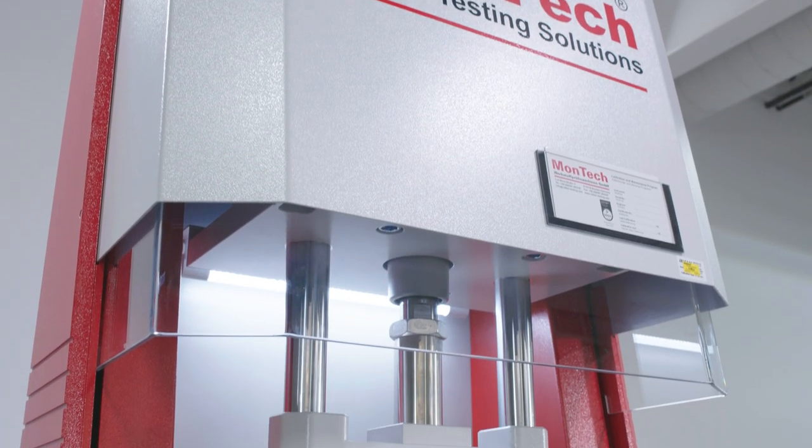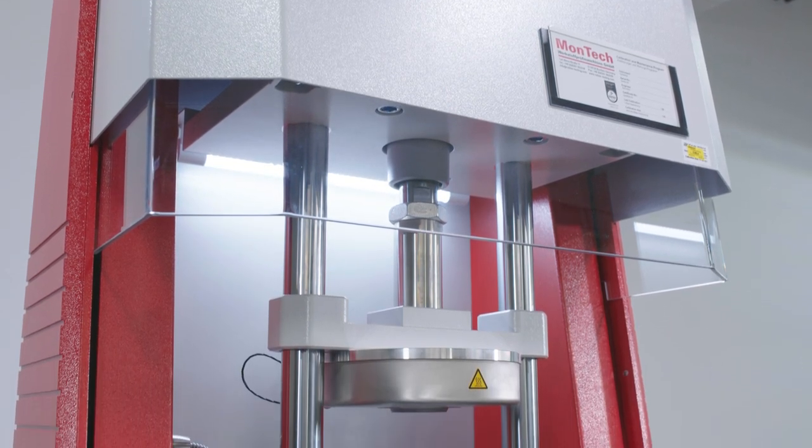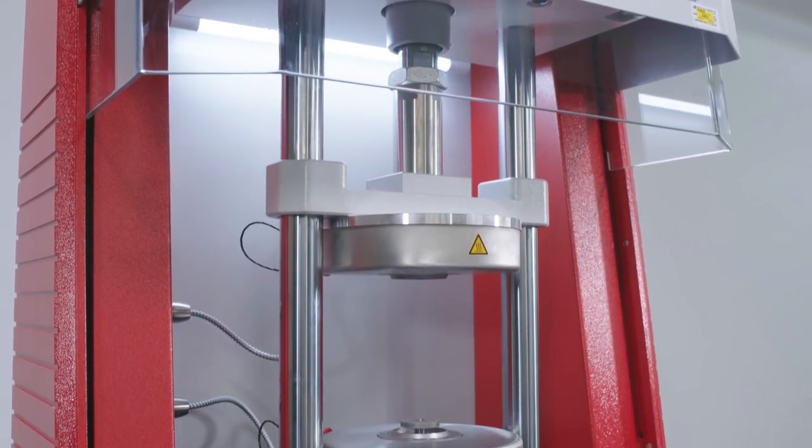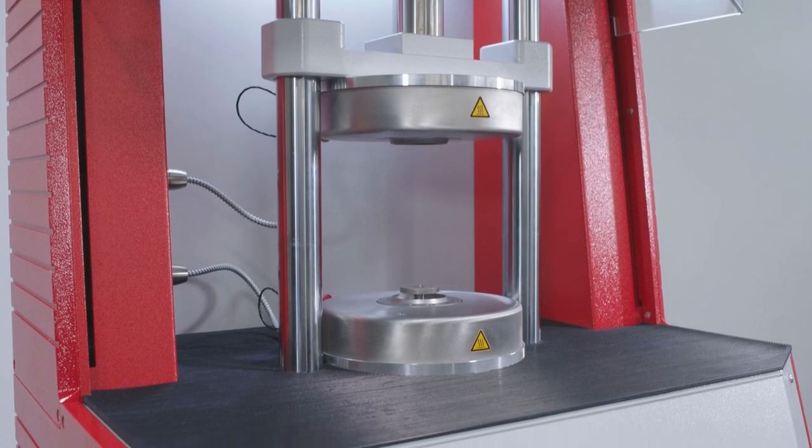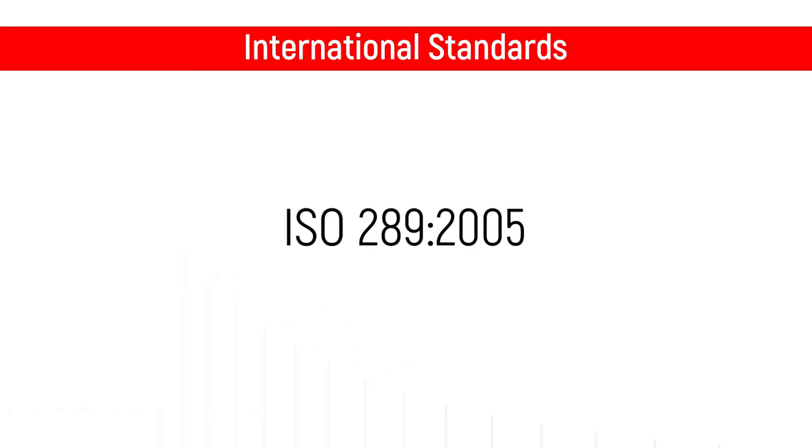It is perfect for gathering basic viscosity information among other material properties, whether for incoming inspections, general quality control, or research and development. The MV3000 meets all standards required by ISO 289-2005 and ASTM D1646.